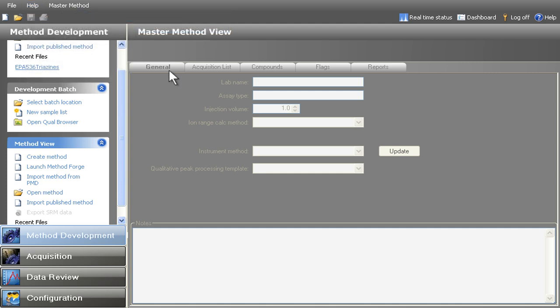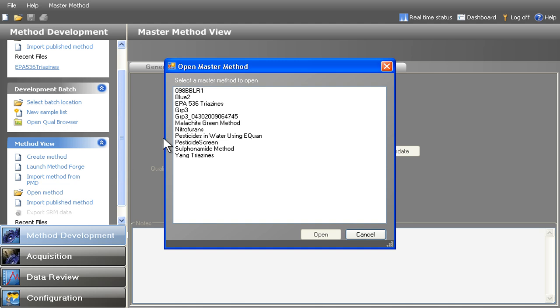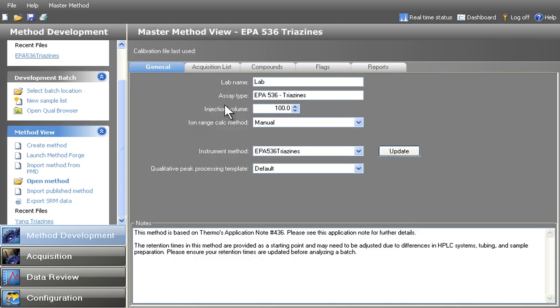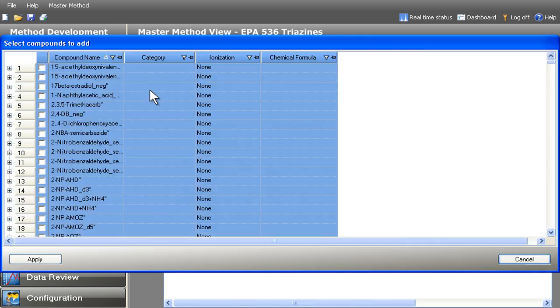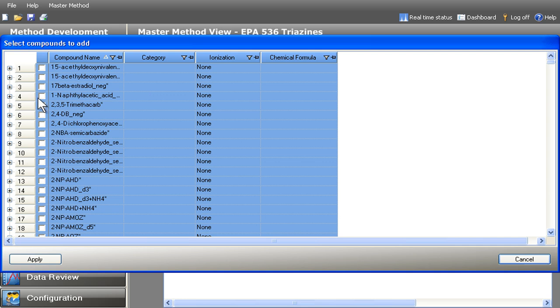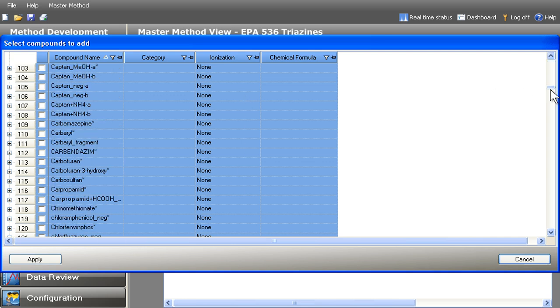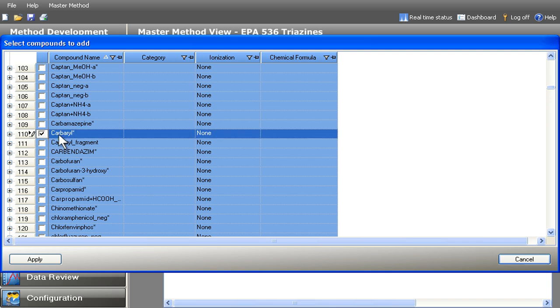Simply select from the list of master methods for instant access to SRM transitions and their associated optimized parameters. The built-in compound data store of SRMs for common analytes makes it easy to modify a method. The compound data store is conveniently organized by analytes. Compounds can be removed from the method or can be easily added by selecting from the compound data store.